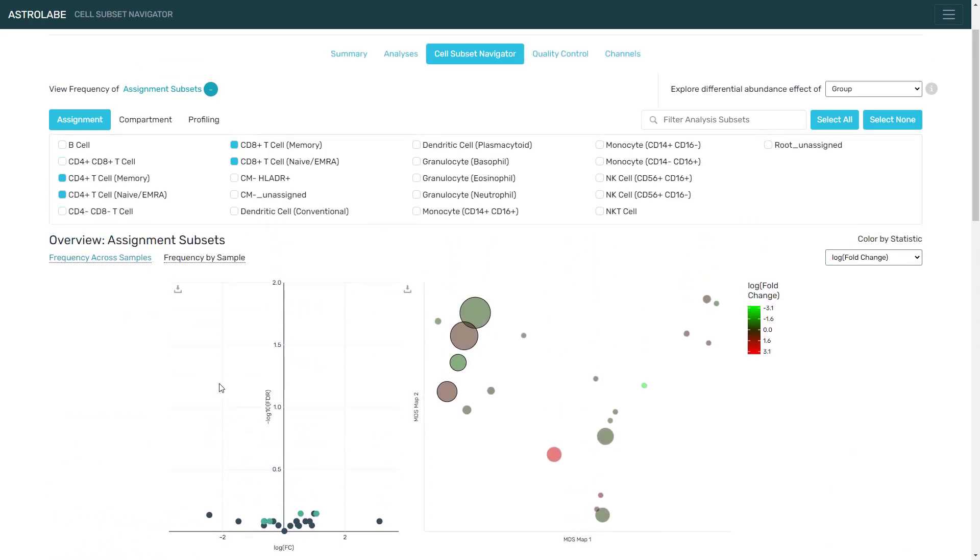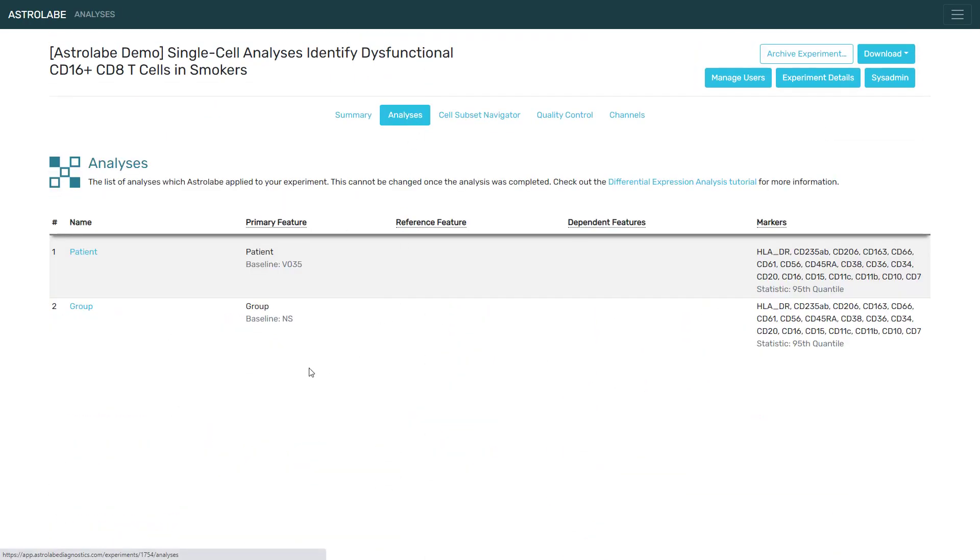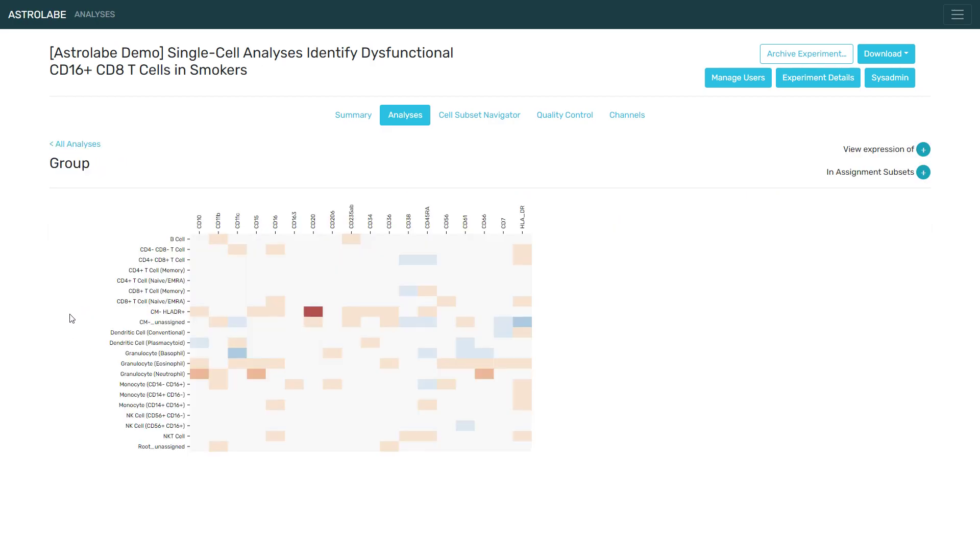Another part of the platform is the differential expression analysis. This allows us to compare the intensity of different markers across the experimental conditions in each one of the populations. So in this heatmap, every row is one subset, every column is one marker. The deeper the color, the greater the fold change.